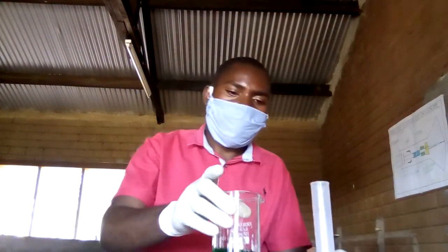So measure the mass. What you are going to get is 141.5.